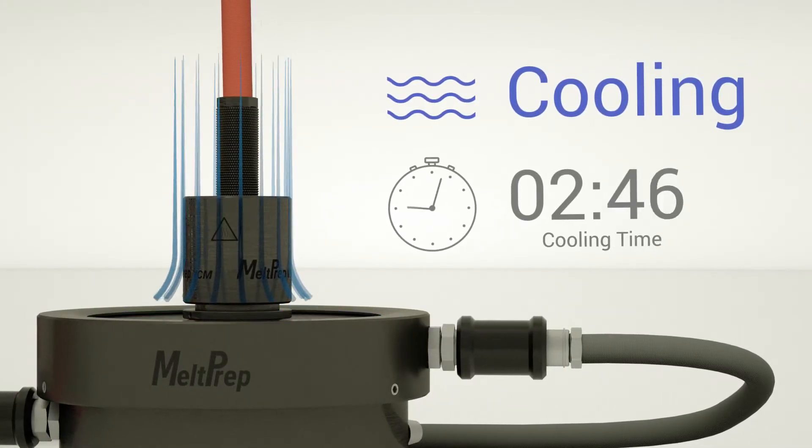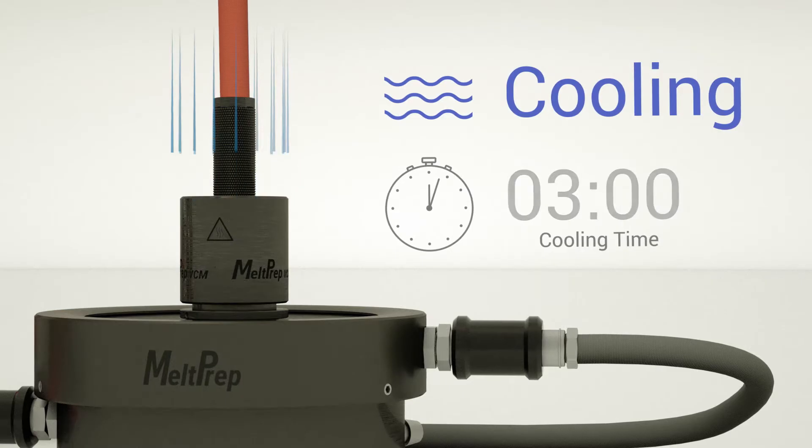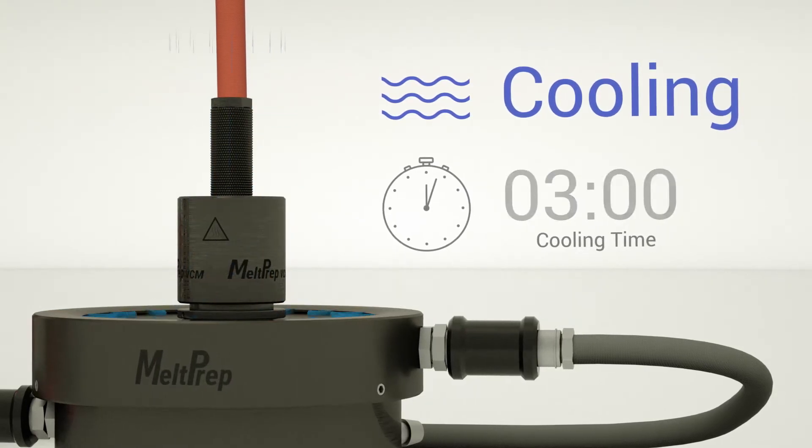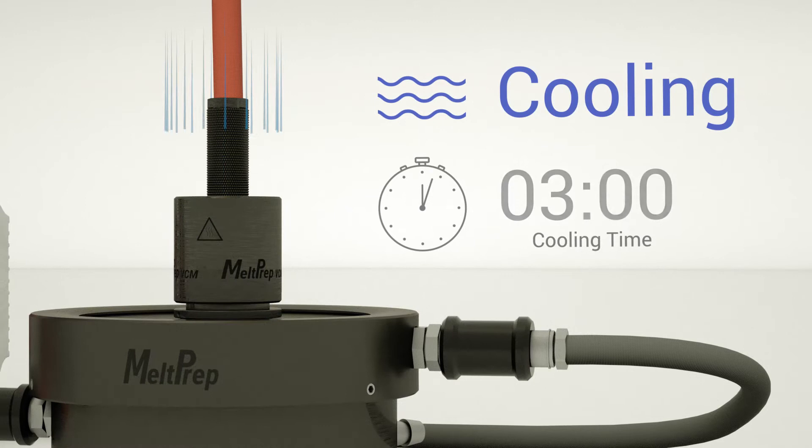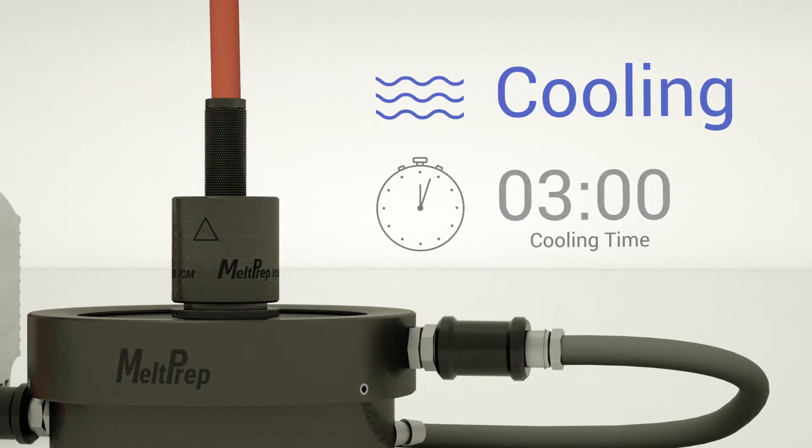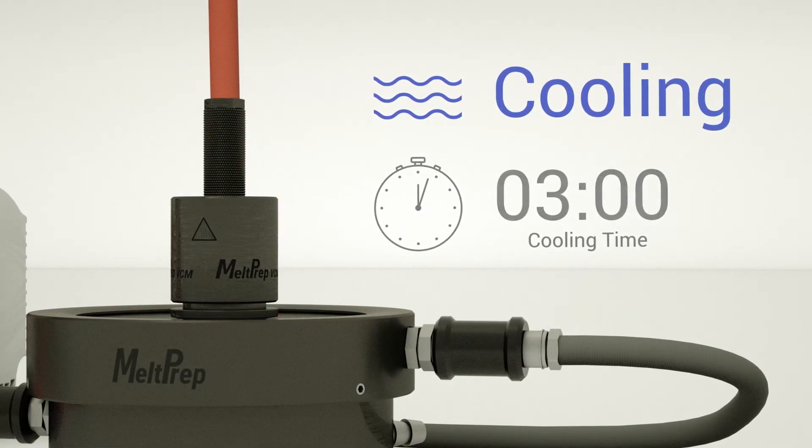After the sample has melted, manually transfer the hot VCM tool to the cooling unit. The compression force initiated by the vacuum acts continually on the sample throughout the cooling process to avoid shrinking voids.